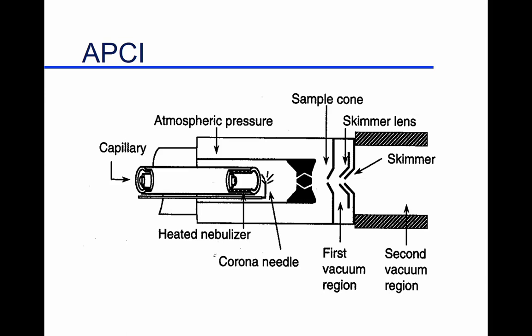Do you have to use special solvents? There are some limitations on the solvents. That's right. Some solvents are easier to work with than others. Again, I don't do enough LC to say this is a good one, this is a bad one. But yeah, you're absolutely right. That can limit the solvents that you would potentially use in the system.